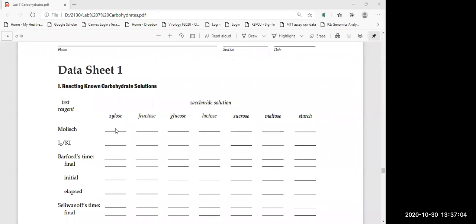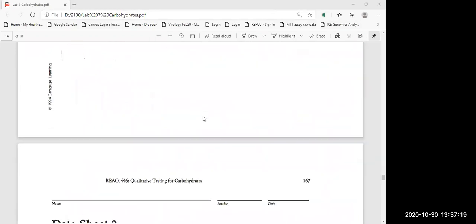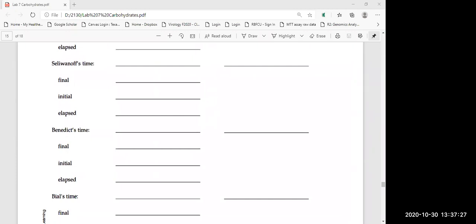Right, I get that. It's just with the Seliwanoff's or whatever, doesn't the color of the product determine if it's an aldose or a ketose? And then the same with if it's non-reducing or reducing. And since we don't have those colors, we're not going to be able to really nail down what our product is. Did he send you anything for the Seliwanoff's? He did, but he just indicated that we're having a positive reaction, and it looks like what matters with those is the color of the reaction.